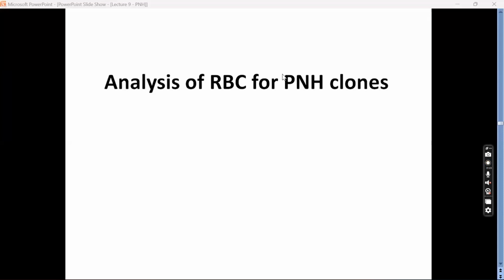Any other doubts? So is that clear now? No doubts, can I go ahead? Right, thank you. If you have any doubts, please put it in the chat box. Now, let's go through how we do PNH analysis on RBCs.